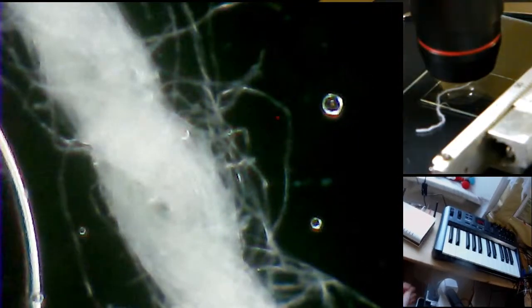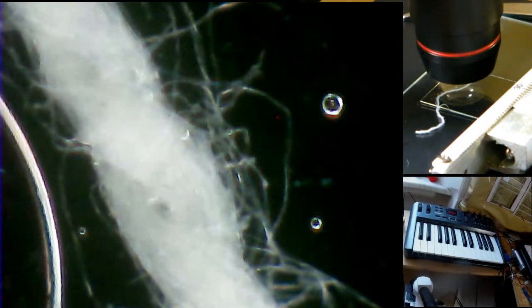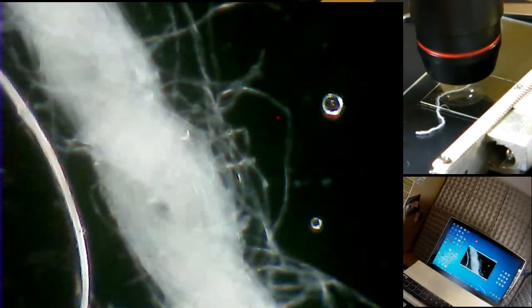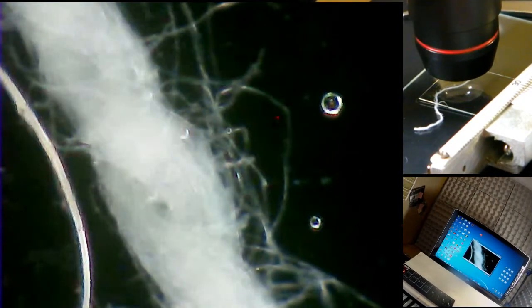No light falling through the specimen. No light coming from the condenser down here, because the lamp is switched off. Also nice, interesting. Alright, let's switch on the light again. Oh, okay. Different filters. Really interesting experiments possible.